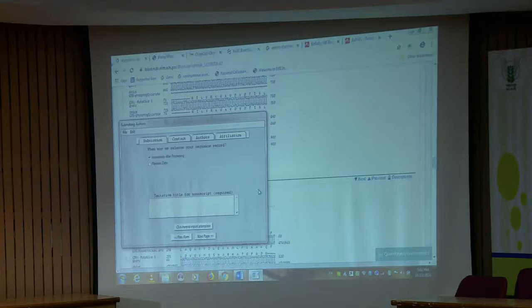If you do not do the curation, then the protein translate will not come and you will not get the entry for the study which you are targeting, right. So the curation part, the sequence editing, you have to do very carefully. Base to base you have to do. Wherever you find a variation, check whether it is actually a variation, and don't just blindly believe the data the company is giving. You have to check each and every base, and that takes the major time.